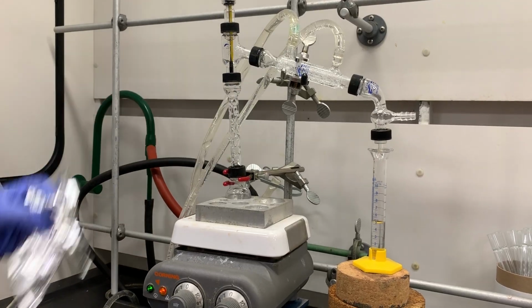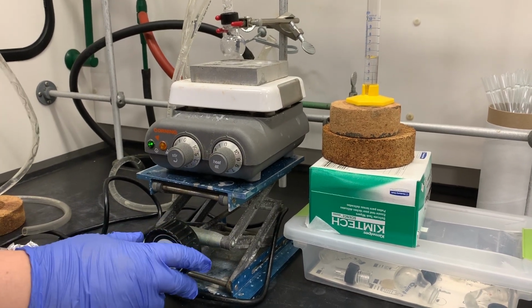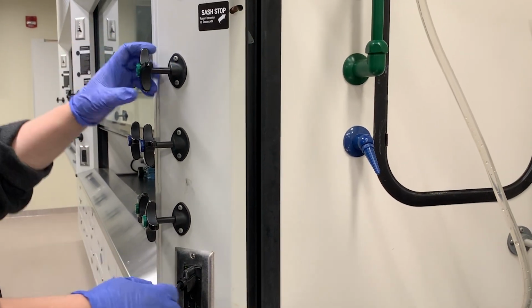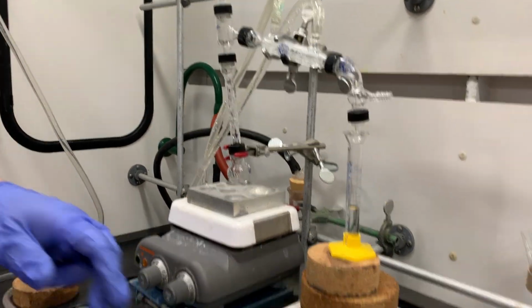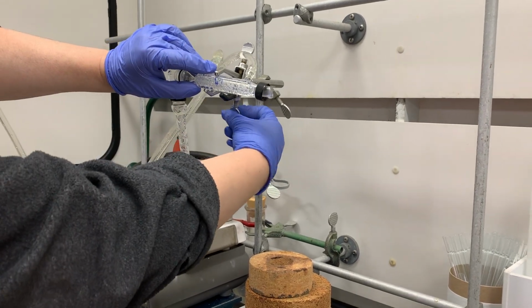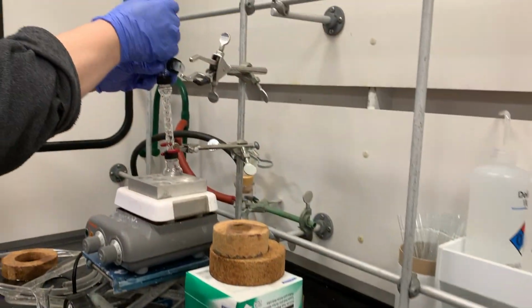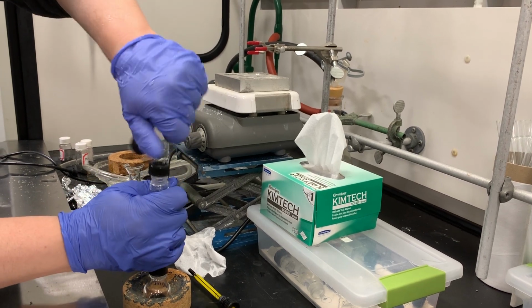To remove the tinfoil, and once you remove the tinfoil, we have to lower the heat. We shut off the water, disconnect the hot plate, take out the thermometer, and disconnect the system. Here you can see we're just disconnecting the adapter pieces, opening the clamp, removing the condenser, and disconnecting all the pieces in the same manner as we did before with the simple distillation.